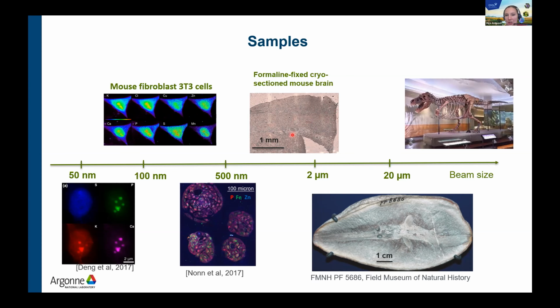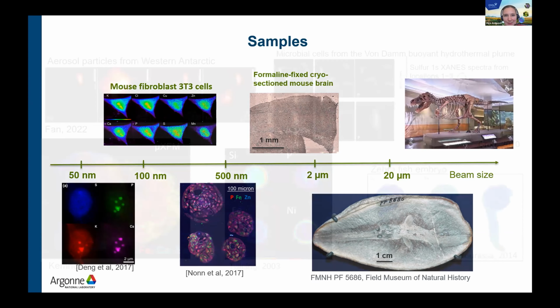We can do tissue sections, and sometimes we work with fossils, and we cannot fit the full T-Rex in the beam, but sometimes we can fit just one arm for some of the very interesting paleontological studies.